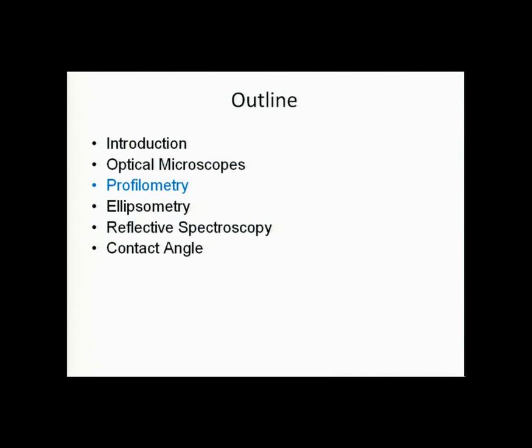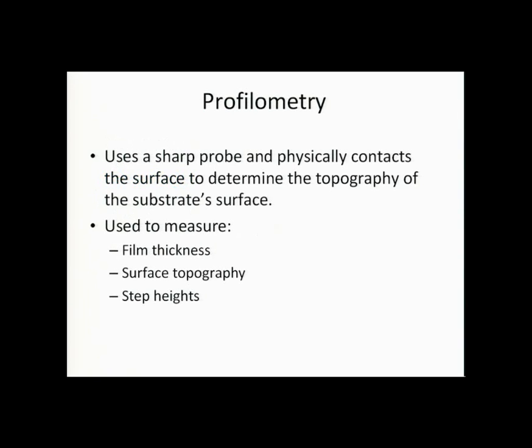Now let's turn to profilometry, a unique, different type of characterization tool. So profilometry uses a sharp probe and physically contacts the surface of a substrate to determine the topography of the substrate. It can be used to measure film thickness, surface topography, as well as step heights.